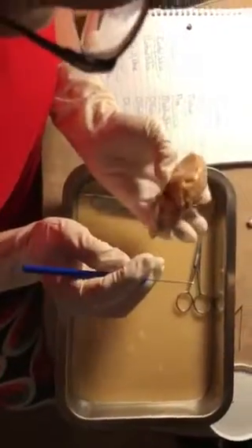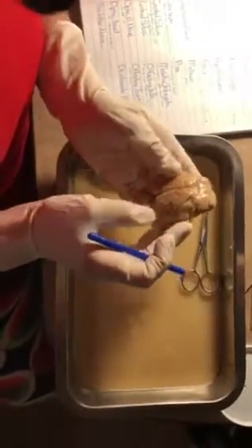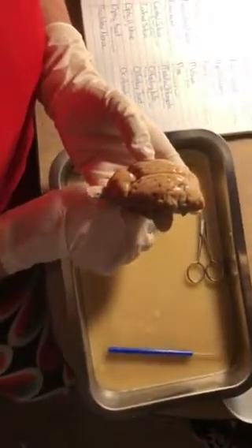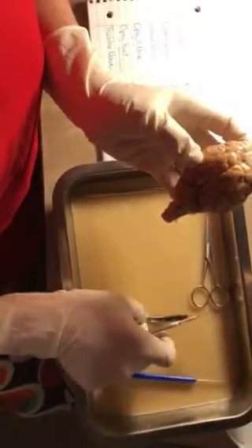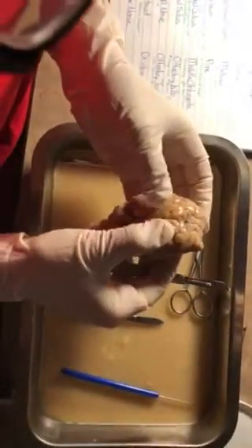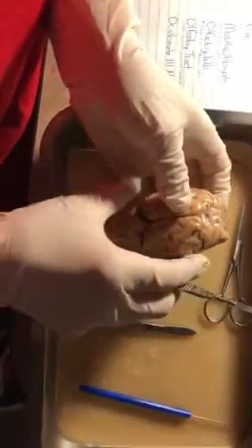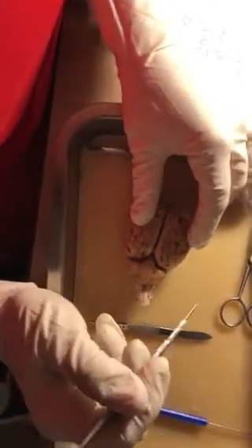So now I'm going to make an incision on the longitudinal fissure to separate the right and left hemispheres of the brain, so we can take a look on the inside of the brain, which would be a sagittal view. So we have to be careful. We're going to separate it just a little bit with the connective tissue, because we don't want to break the central sulcus, which divides the frontal and parietal lobe.